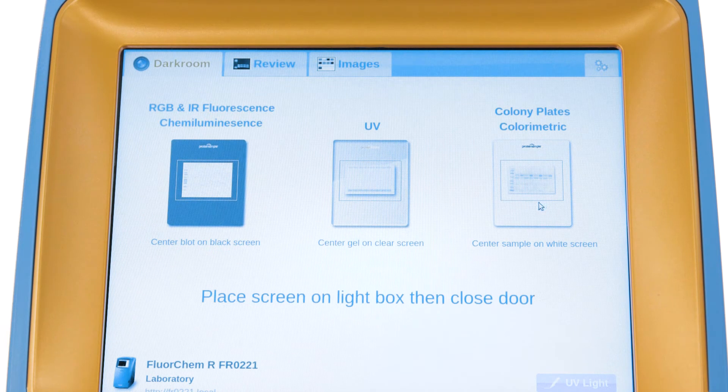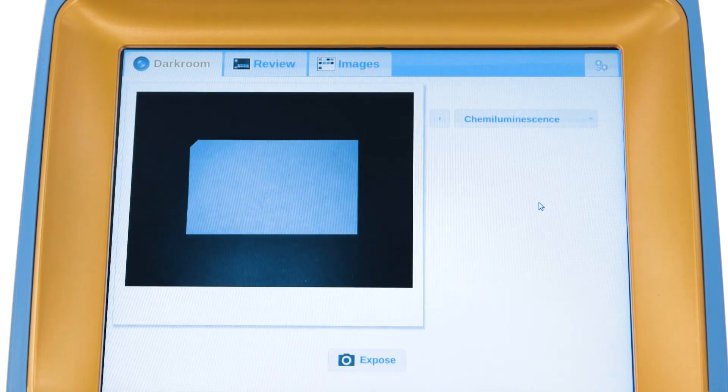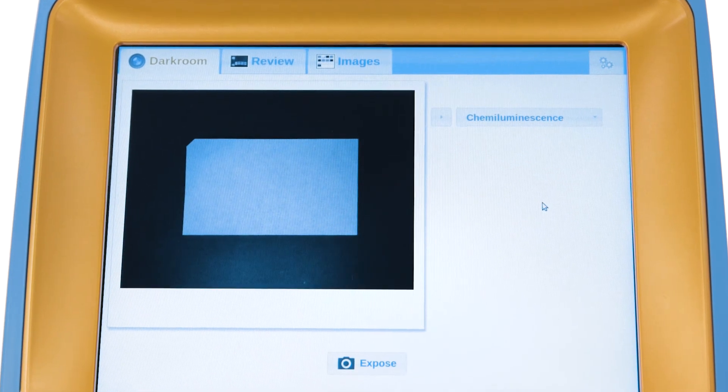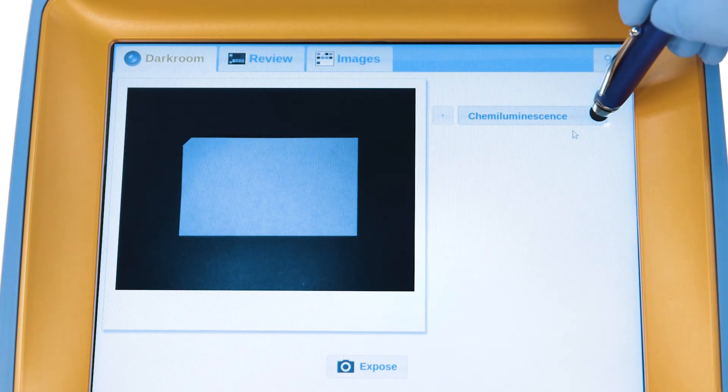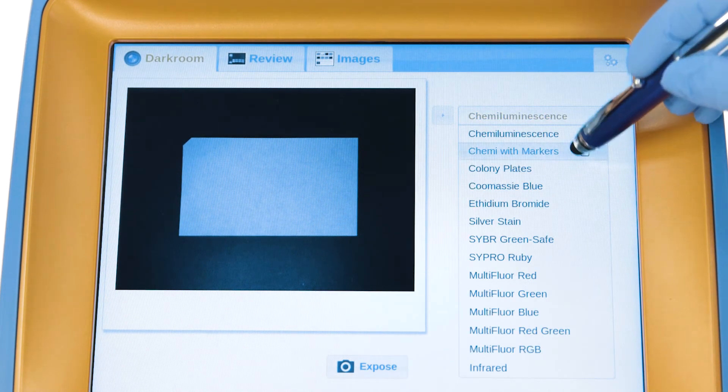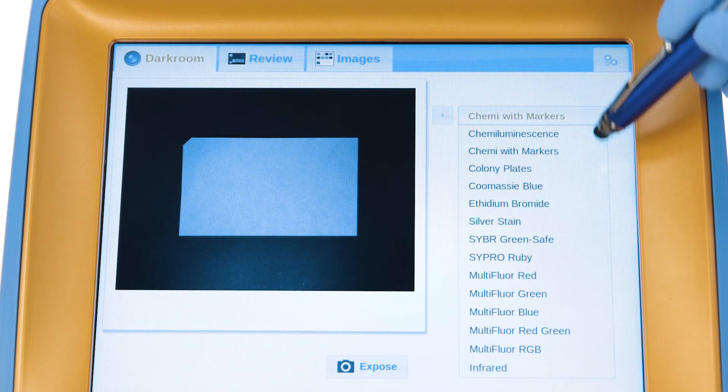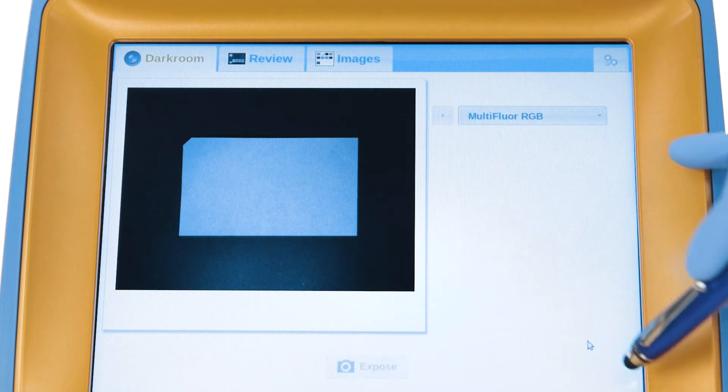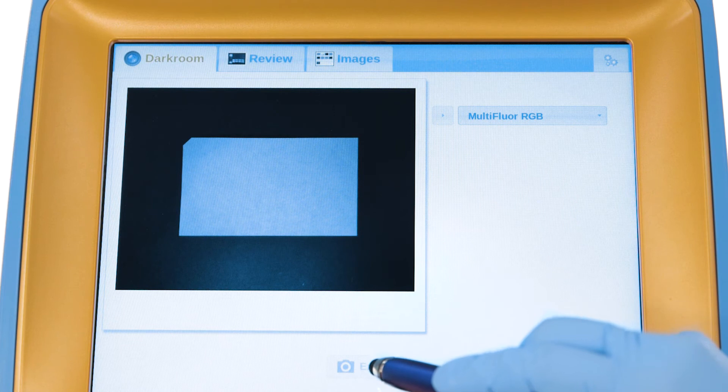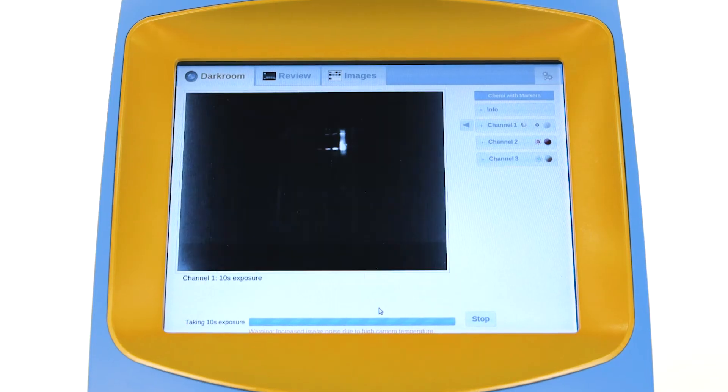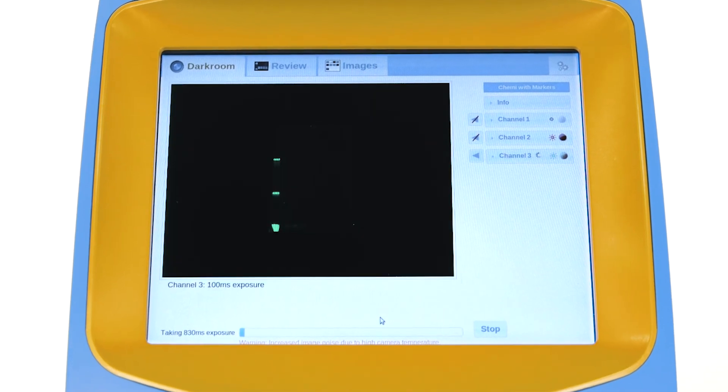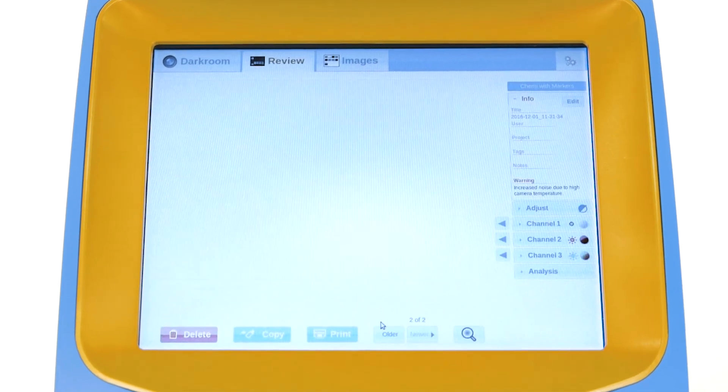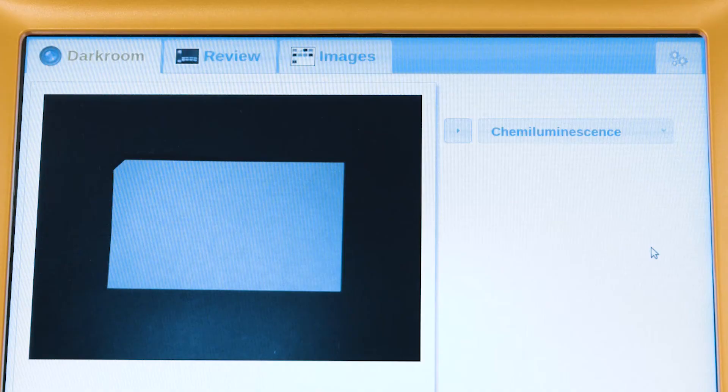When the sample is loaded and the door is closed, the FluorChem display changes to show the digital darkroom controls. In the darkroom tab, each FluorChem Imager comes preloaded with a set of protocols customized for different applications. Simply select the appropriate protocol, then click on expose. The Imager will take some test exposures to determine the optimal exposure settings, then take a final image.